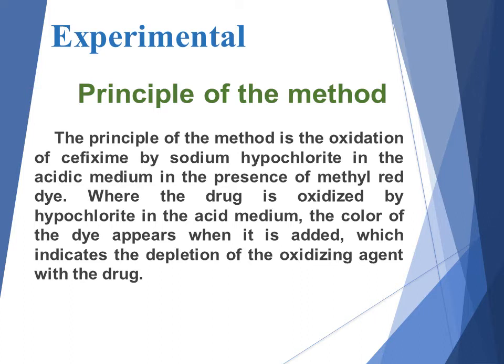The principle of the method is the oxidation of cefixime by sodium hypochlorite in the acidic medium in the presence of methyl red dye, where the drug is oxidized by hypochlorite in the acidic medium. The color of the dye appears when it is added, which indicates the depletion of the oxidizing agent with the drug.